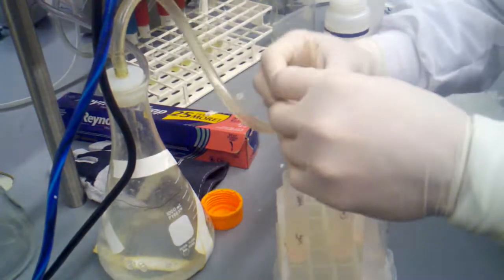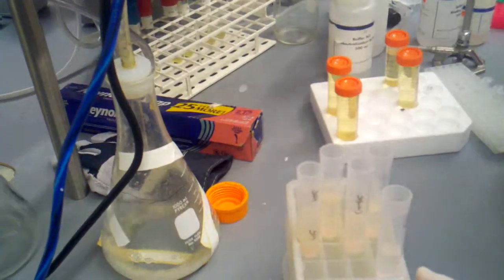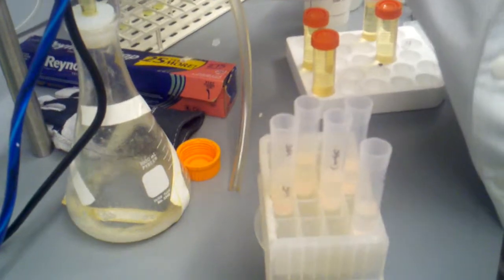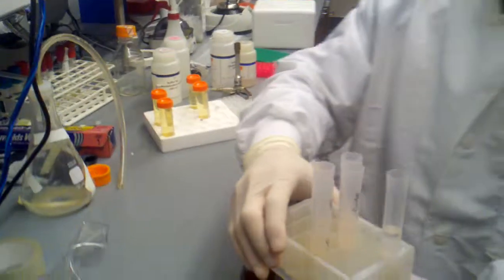Oh, that one is a little bit too much there. You've got to be careful of that one. You always want to make sure that there's a little crack in between it. That was a little bit too big there. So we're going to empty that tube out, and I'm going to shut off the vacuum. It's back there. And we're going to head back over to our desk, where we're going to pour the rest of our protein sample onto the columns.